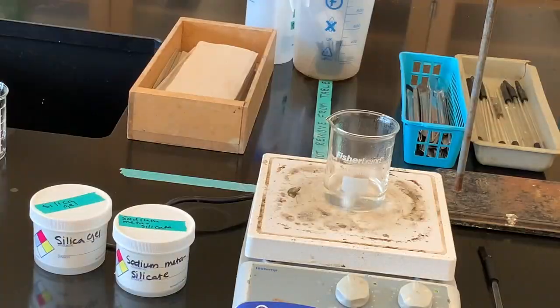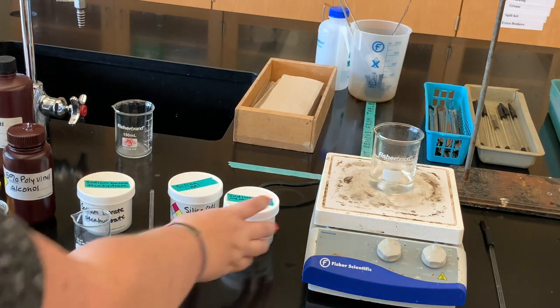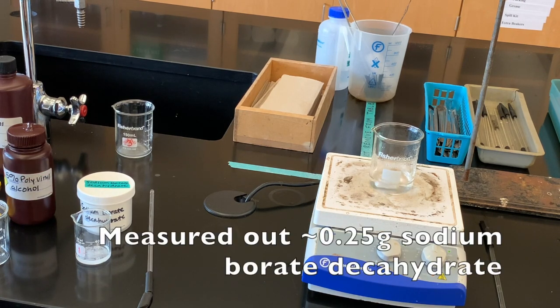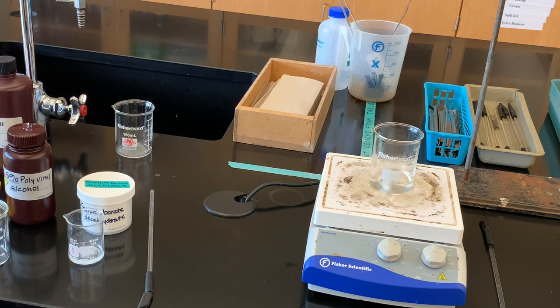We're going to make a cross-linked polyvinyl alcohol polymer. Moving on to Part B — I'm not using the silica gel or the sodium metasilicate anymore. Here I'm using my sodium borate decahydrate. I measured out about 0.25 grams of that and put it in a 50 milliliter beaker with about five milliliters of distilled water. I'm going to set that on the corner of my hot plate to dissolve.